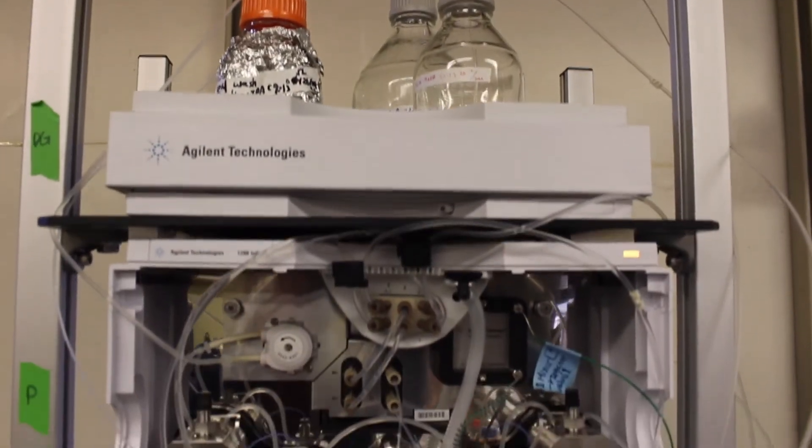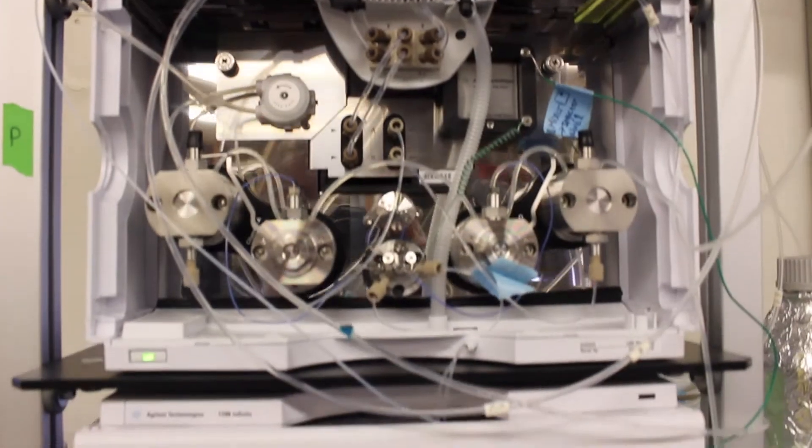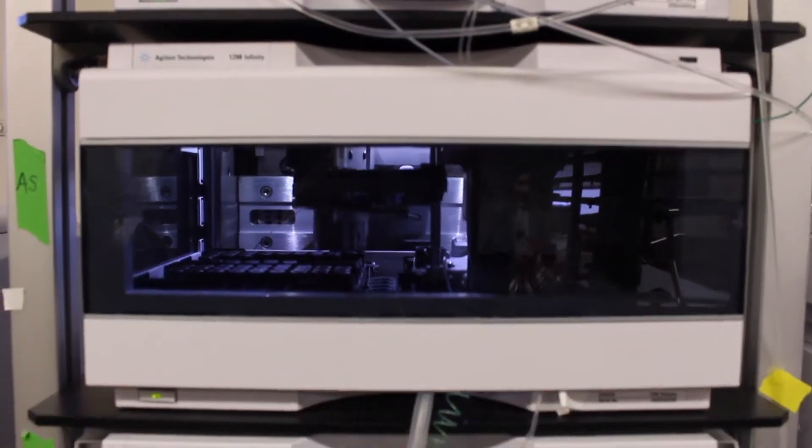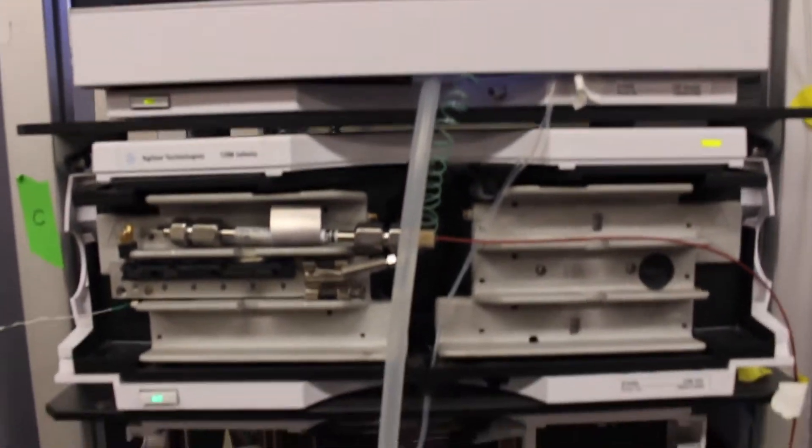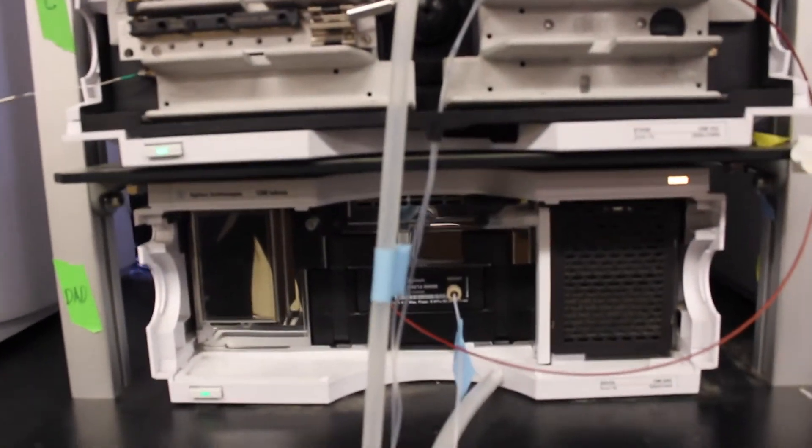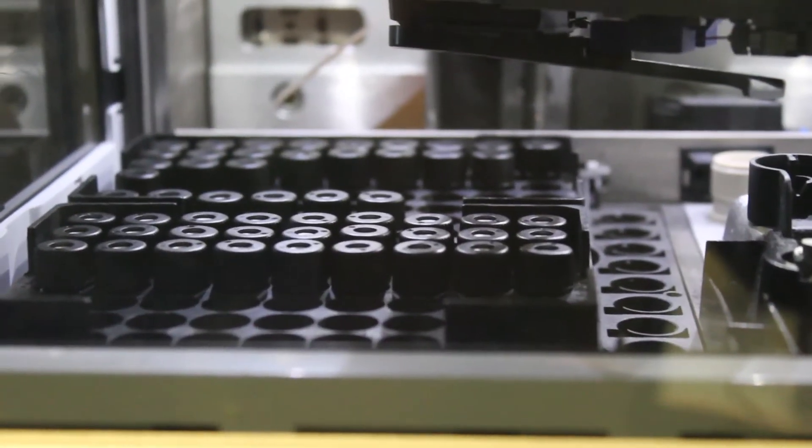This ultra-high-performance liquid chromatography is connected to a diode array detector and a fluorescence detector, which allows us to analyze phytophenolics in complex food matrix. Many of our publications on olive and olive oil phenolics were conducted on this UPLC.